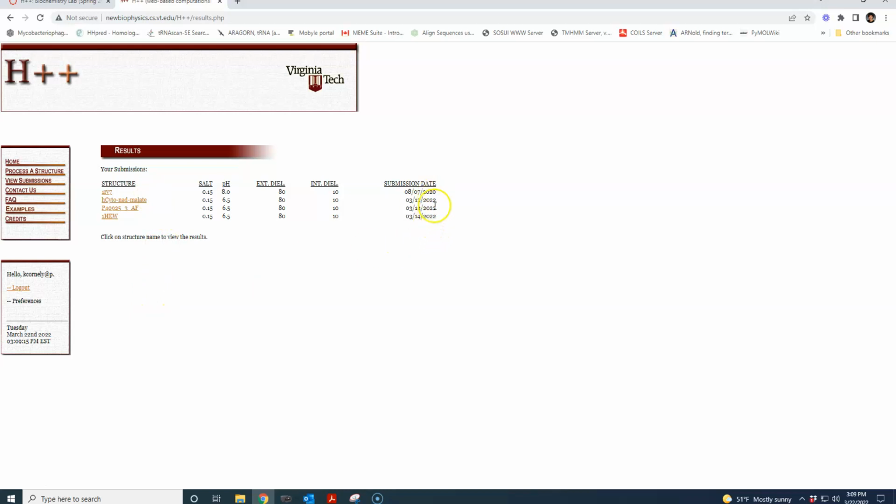So I've done these recently. Dr. Bell gave a summer workshop in the summer of 2020. So that was when I was following along with the workshop. I have access to everything that I've done. So I'm following a PowerPoint that Dr. Bell gave us, and it is posted on Canvas so that you can look at this.